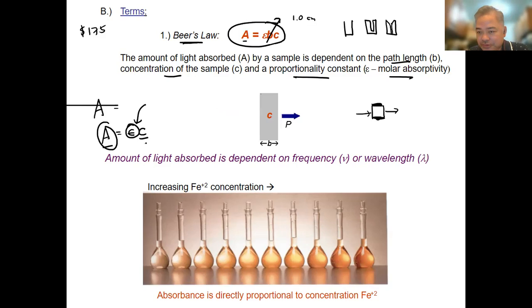experiment that they do. I don't know if you know it. Doon sa mga blood analysis, if they want to determine creatinine or kung anong metabolite sa ating katawan, they already developed a method there. And some company, they patent it, and that's what they use. Okay, so the way that they do is they have known the molar absorptivity. Okay, and all you need to do is get the absorbance, and you can get the what we call the right concentration right away.